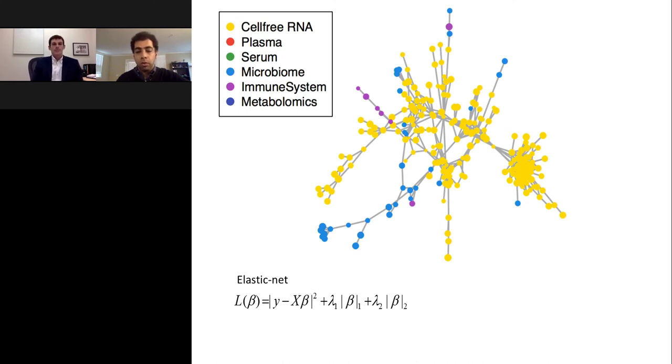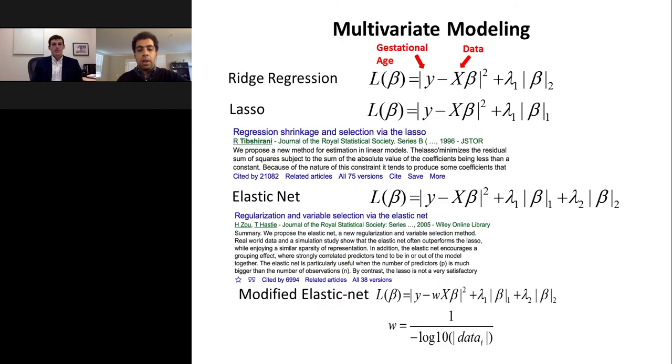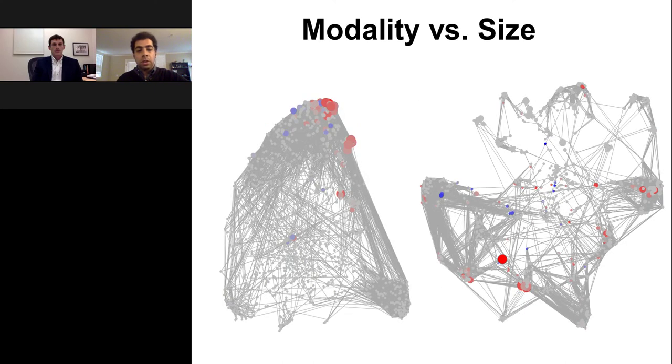They are completely overwhelming the predictive model. So we had to go back to our equations and add an extra term down here that would penalize the data sets that are producing a larger number of measurements. That helped improve our predictive power a little bit, as seen in the gray bar here, but that wasn't enough.